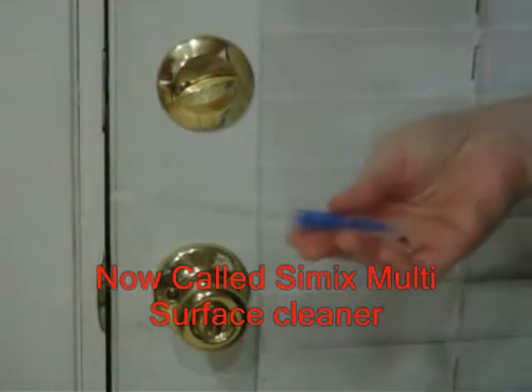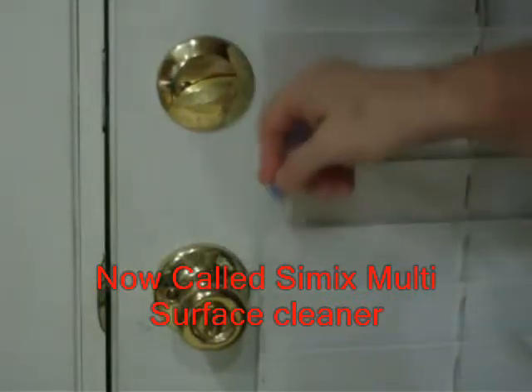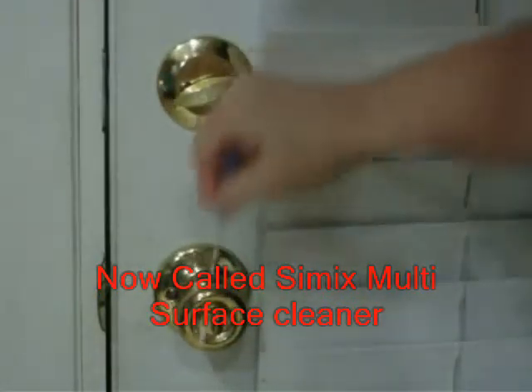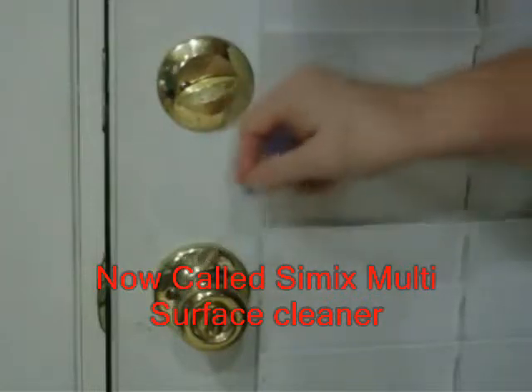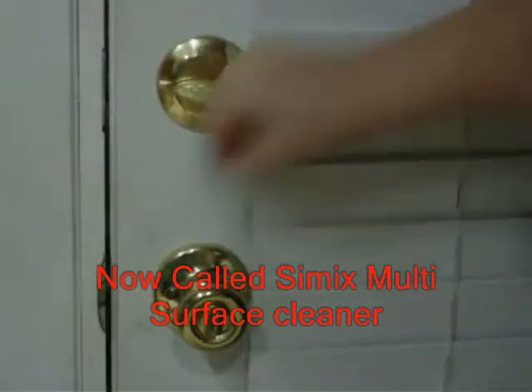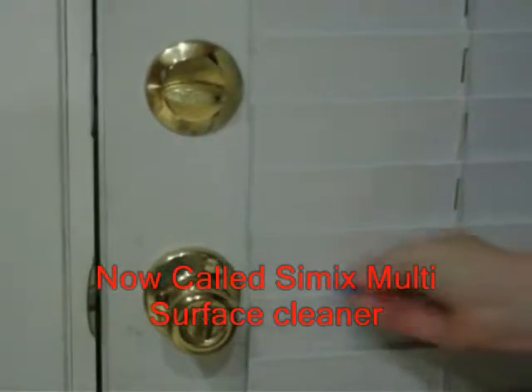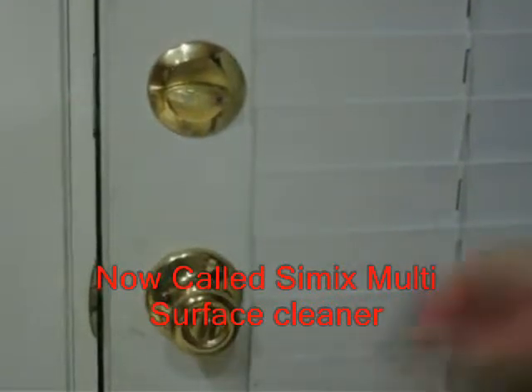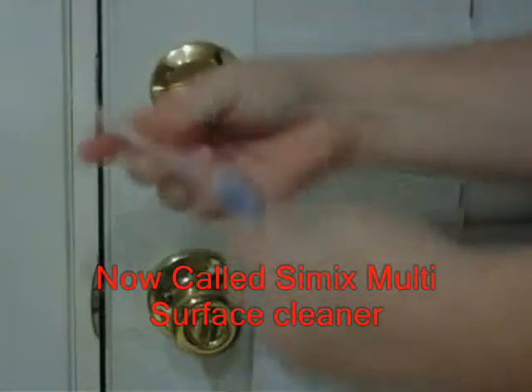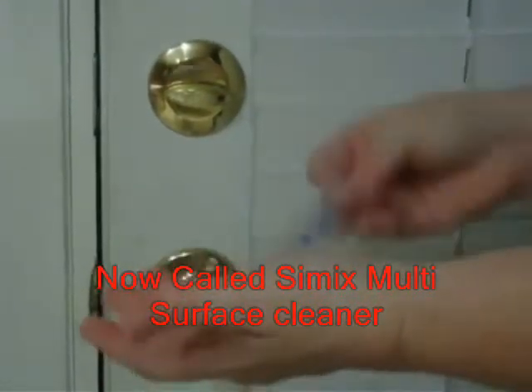At Simix, we use the Hygiena meter to show how effective Oxy1 is at eliminating bacteria, germs, and viruses from these surfaces. This method provides immediate feedback of how effective Oxy1 can be. In this video segment, we're demonstrating the before bacteria levels of a door handle and door face. Then we're going to clean it with Oxy1 all-purpose cleaner, and then re-measure the ATP levels.